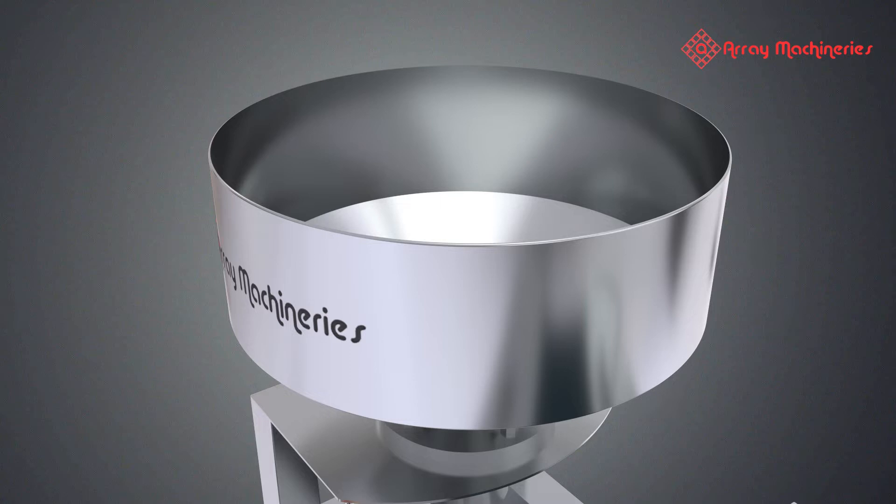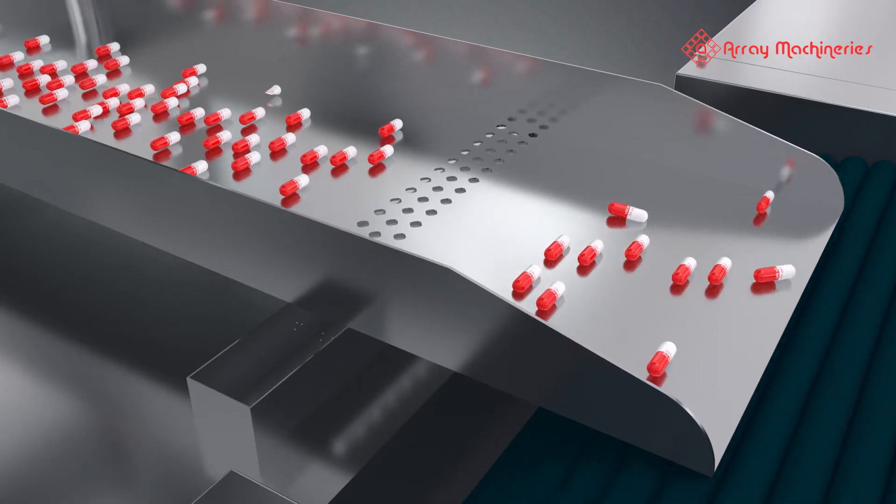The tablets are manually loaded into the hopper of the machine. The tablets move forward in a controlled manner with the help of a vibratory linear feeder.